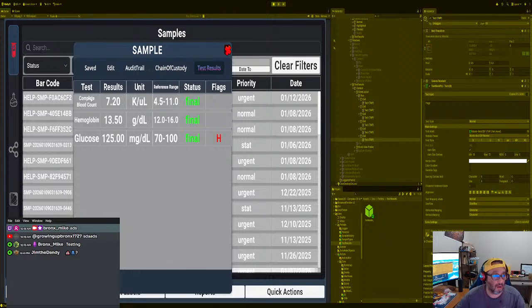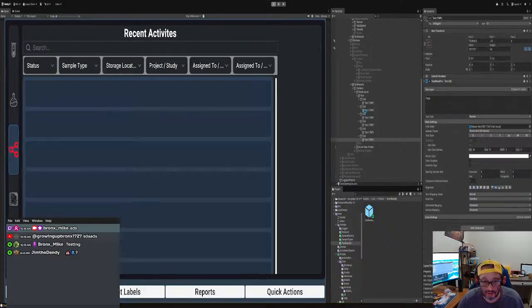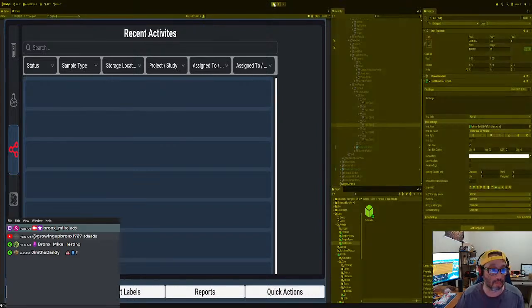Now, if you wanted it all to be even, we could just shrink that up. Reference range to ref range. So we do here. Yeah, that way all the text stays the same size. Up to you. Again, it's up to you. Come on. Oh, I thought it was loading.